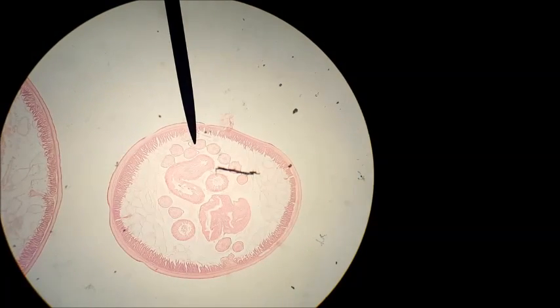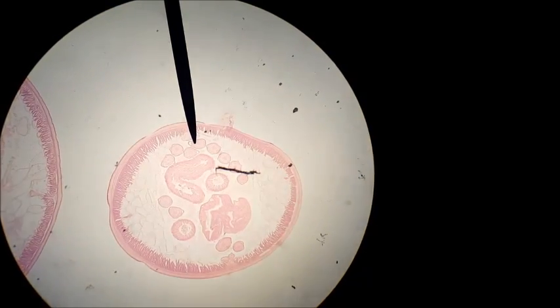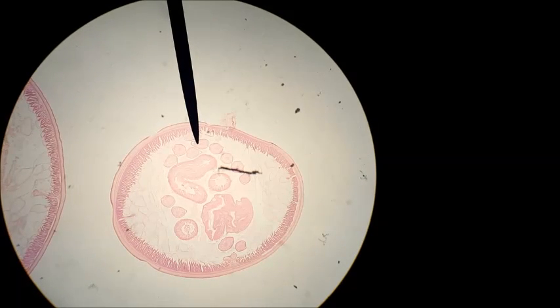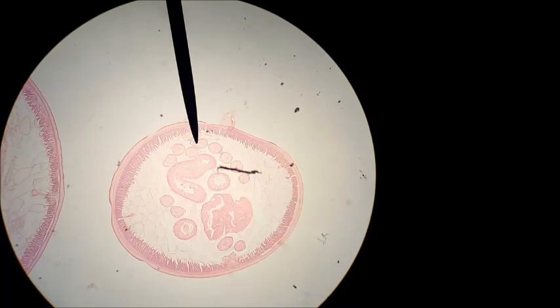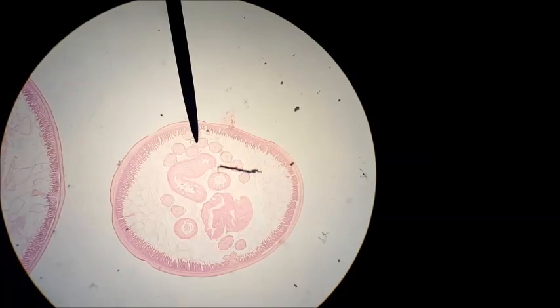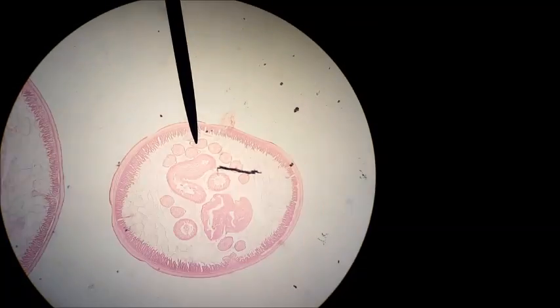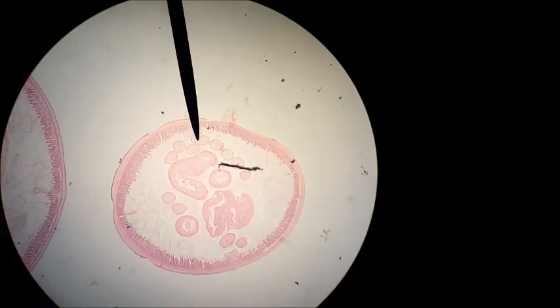This is a cross-section through a parasitic nematode called Ascaris Lumbricoides. This is a male. Ascaris worms have a tube within a tube body plan. There is a mouth and an anus present.